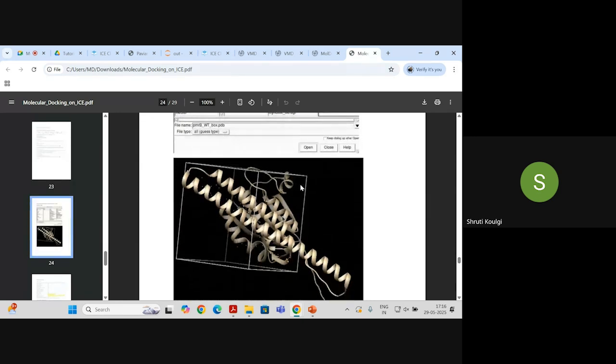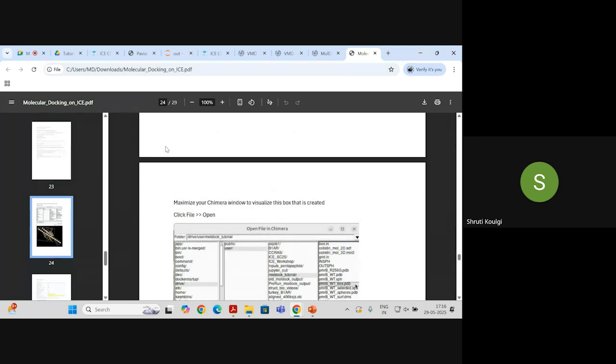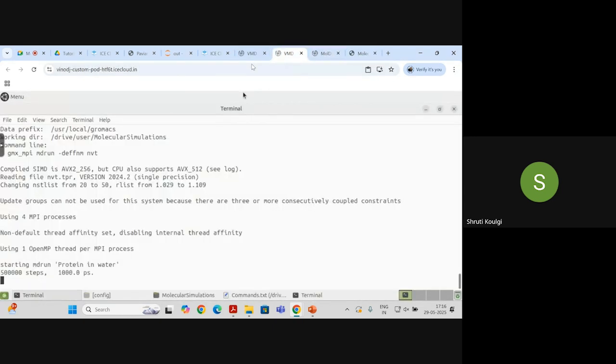So this PDF is at your disposal. You can use this for reference. If we check this, VMD is still running.